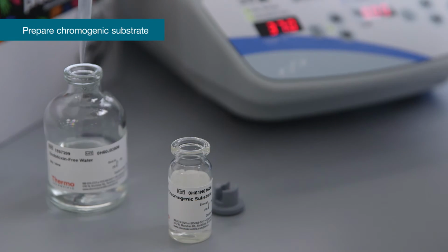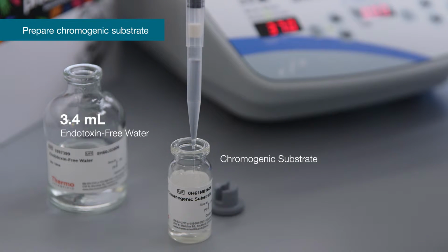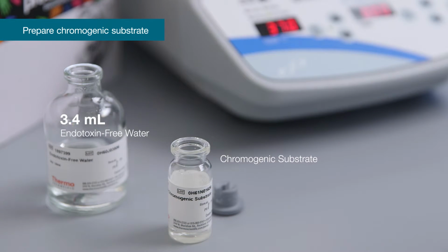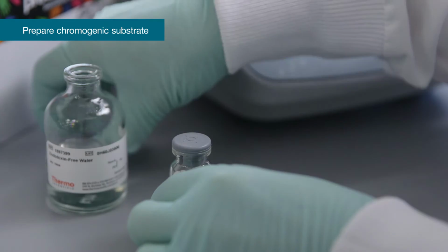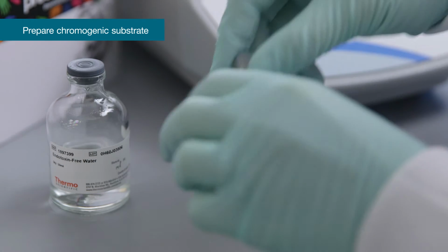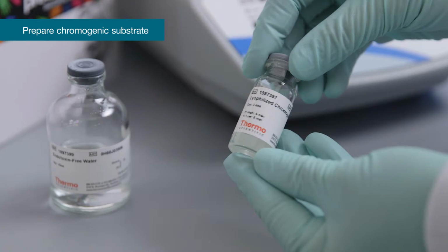7 minutes before the end of time T1, reconstitute the chromogenic substrate with 3.4 ml of endotoxin-free water. Mix gently by tilting and swirling the vial. If more than one vial is required, pool 2 or more vials before use. Pre-warm the reconstituted chromogenic substrate to 37 degrees Celsius for 5 minutes before dispensing into plate wells.